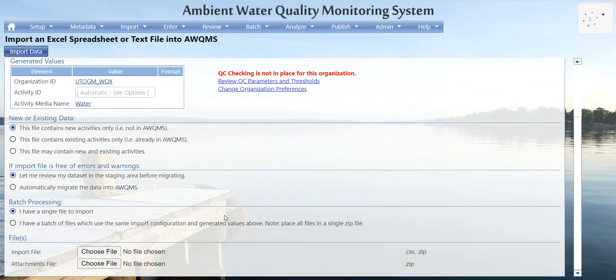This data has already been migrated into Aquums, so we'll see risk-of-overriding-data errors. In the section that says if the import file is free of errors and warnings, let me review my data set in the staging area before migrating — I would never change that default. We always want to do a result count check and an activity count check to make sure the import configuration is reading the file correctly.